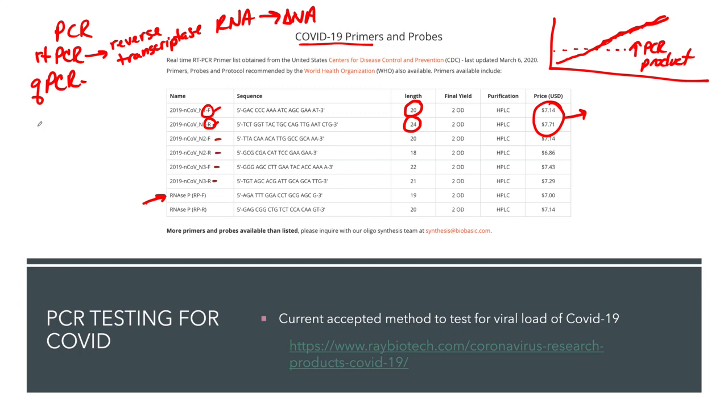And there are a couple more different types of PCR. I'm not going to get into all of them, but the general idea is that we have this general tool, PCR, where we replicate from a single strand of DNA into millions of copies of that DNA. And then we can take that tool and alter the way that it's used and use it in different ways. I thought it would be important and relevant to show you that this PCR method is what is used in our modern day genetic diagnostics.